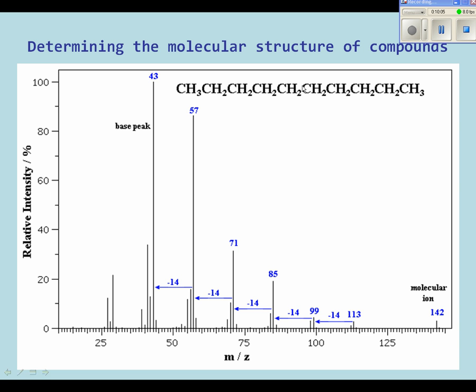And what you would end up with are a range of fragments that go through the mass spectrometer, fragments of different mass, of course. They pass through the mass spectrometer and produce a spectrum, a fragmentation spectrum that looks like this. And we can look at this spectrum to analyze and go backwards to analyze and determine the structure of the molecule. So it's an extremely important tool.